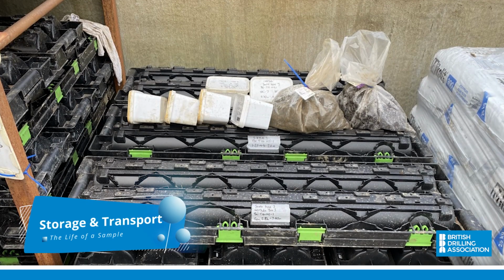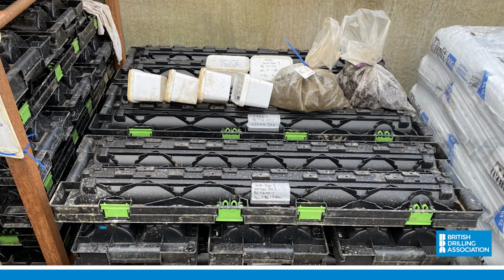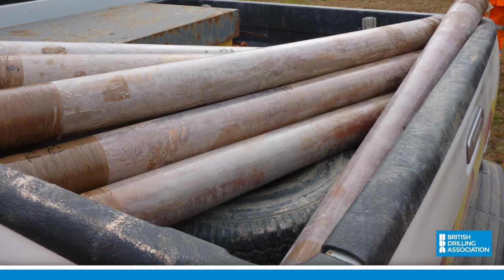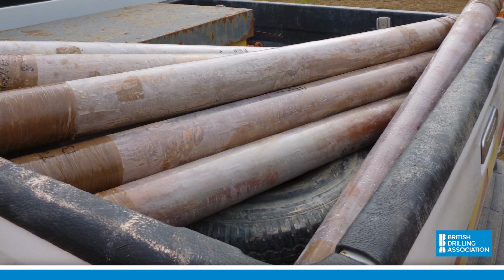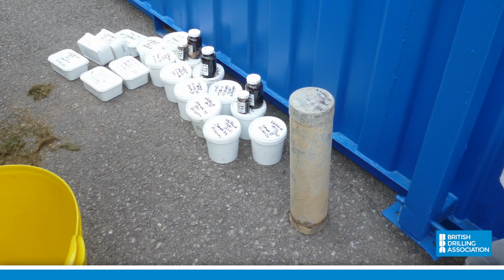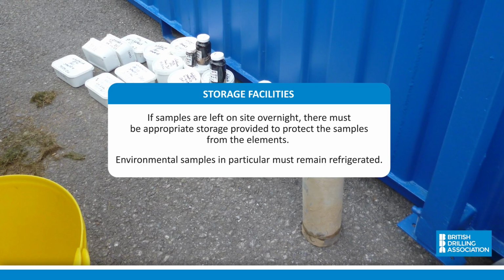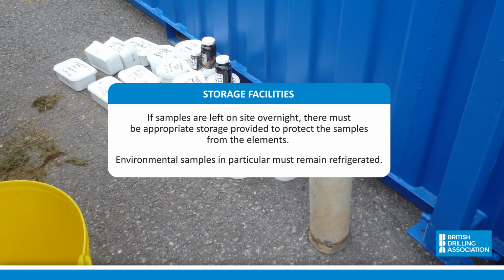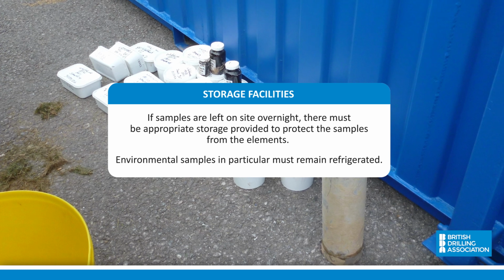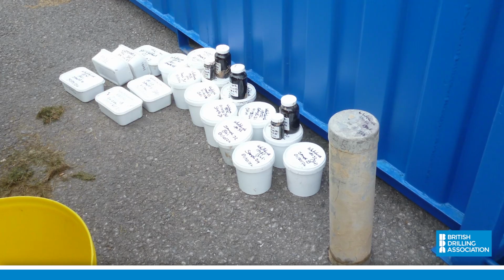Samples should be adequately stored and packed ready for transportation, as improper care can lead to further deterioration and disturbance. Samples must not be allowed to roll around in the back of pickups or vans or left in the vehicles overnight. Project managers and site supervisors must have an appropriate storage facility on site for all types of sample, which may require refrigeration for environmental samples. Samples should be segregated appropriately and maintained in cool conditions.